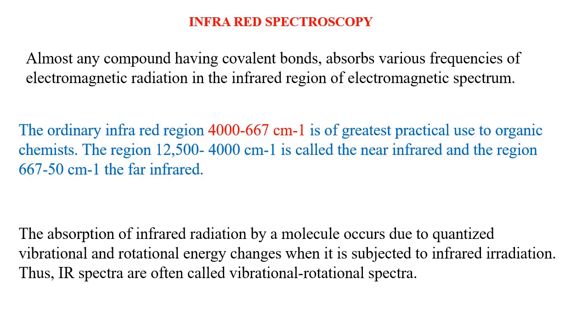Among the infrared region, the vibrational infrared portion, 4000 centimeter inverse to 667 centimeter inverse, is of greatest practical use to organic chemists, right?